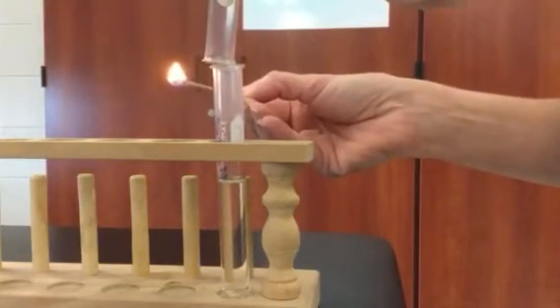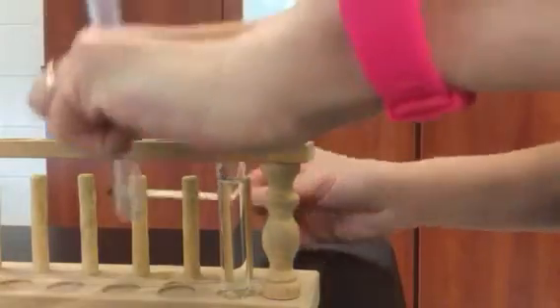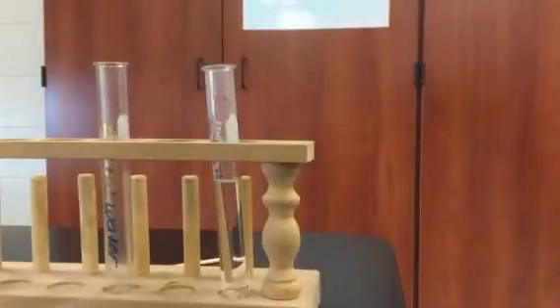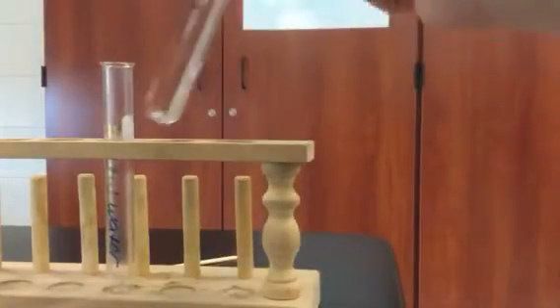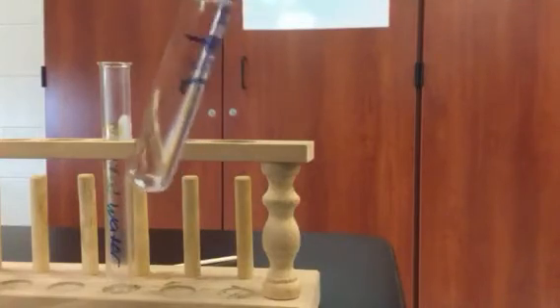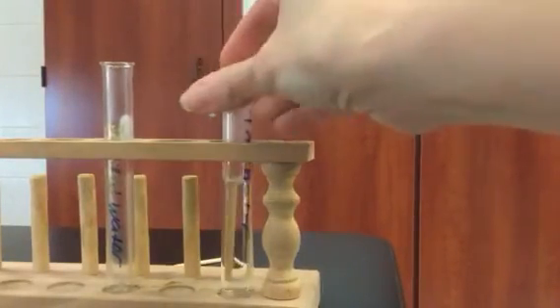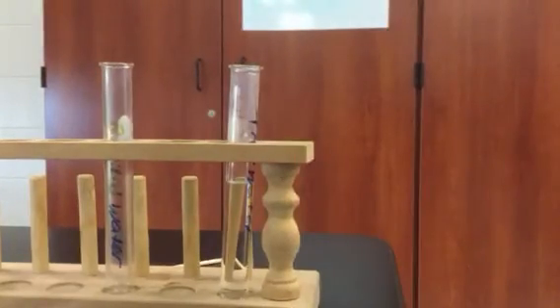And I'm going to put it in here in between these two test tubes. And you can see this is what our tube looks like when we're done. It's reaction two.